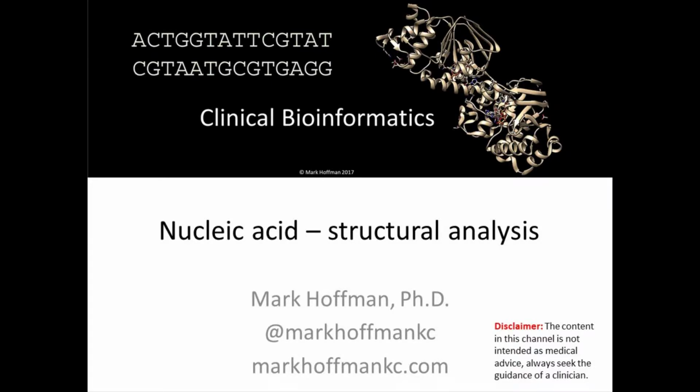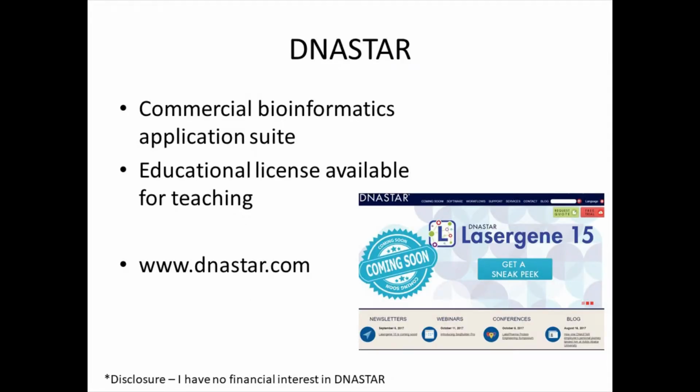In this session, we will learn how to evaluate nucleic acids from the structural perspective. Future sessions will cover how to evaluate nucleic acids from the sequence perspective. We will be using an application provided by DNA Star, a commercial bioinformatics application suite, under their educational license.